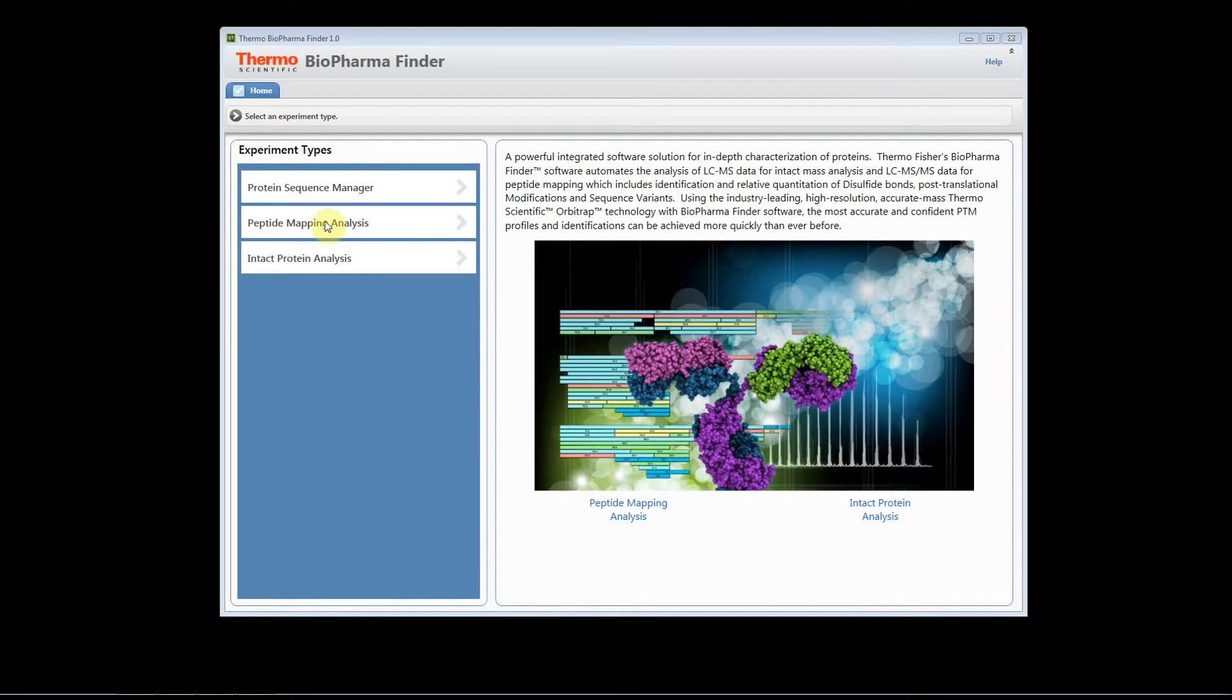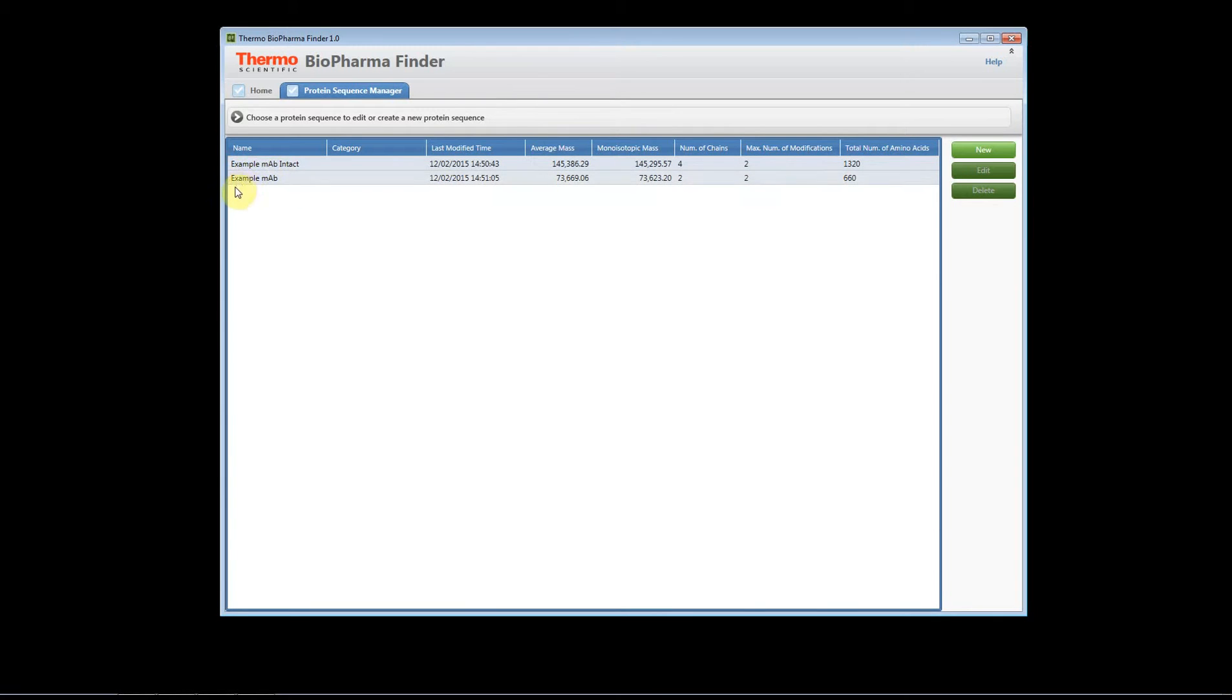You need to import your protein sequence, so add a protein sequence to the software before you start your peptide mapping analysis if you'd like to have identifications associated with the components.